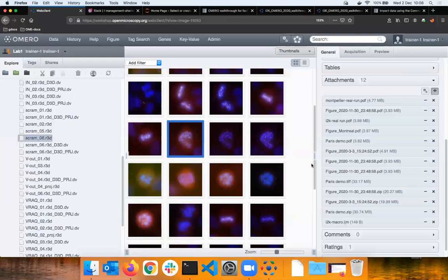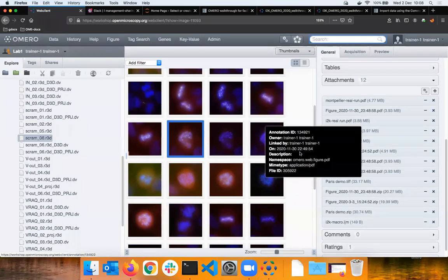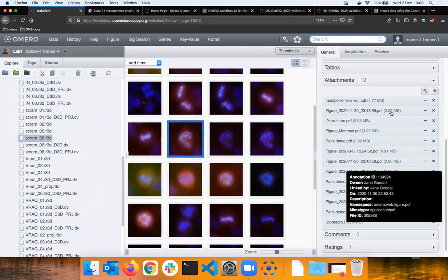If you add something which rather resembles a descriptive protocol into the attachments, you can take some advantage of that as well. If it's PDF or CSV, the big search, which I've just shown you for key value pairs here on the top right, will search in those attached files. If that be a text file or CSV or a simple PDF, the content of that attachment will be really indexed and searched by the big search. Okay, so these are the things it can do.